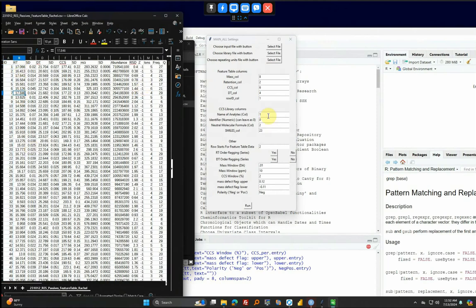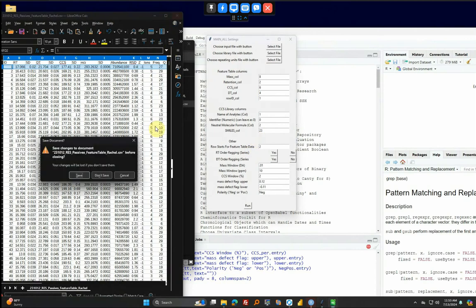So that's something. And then that's all except for the row starts, which is 2. And you should always have row start as 2. There could be some errors. So if you have more than one header, maybe remove those headers and you can paste it in after it's been processed. But just have a single header. So that's it for that.